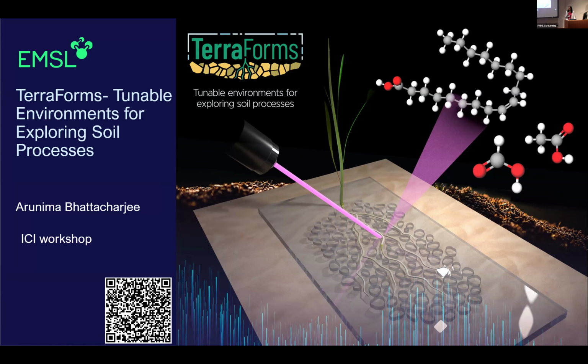So today I'm going to talk to you guys about our EMSL capability called TerraForms. Many of you have heard about this, and a lot of you present today have also seen many of these capabilities. We think that most of these capabilities that we have grouped under TerraForms are really useful for studying soil processes, specifically because soils are really heterogeneous and opaque and difficult to image.